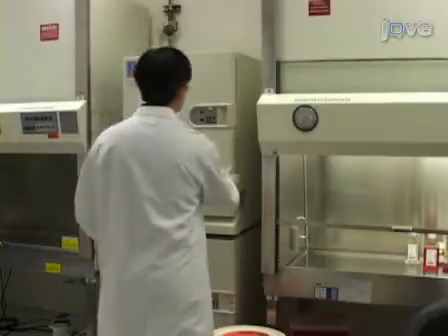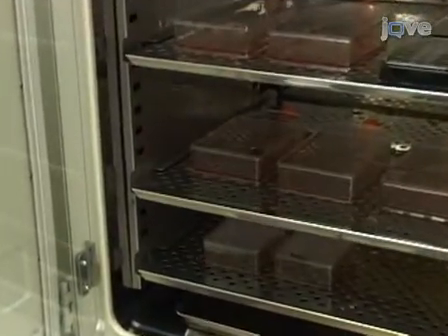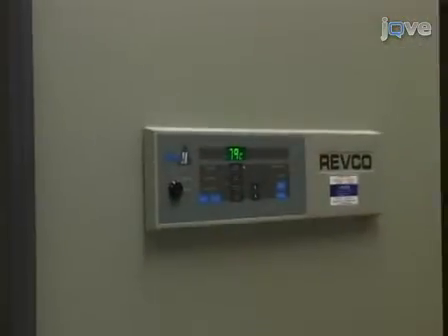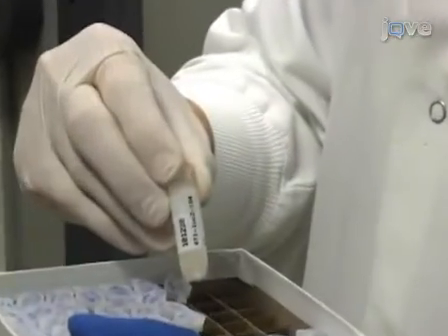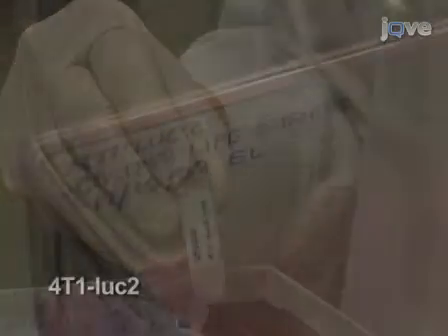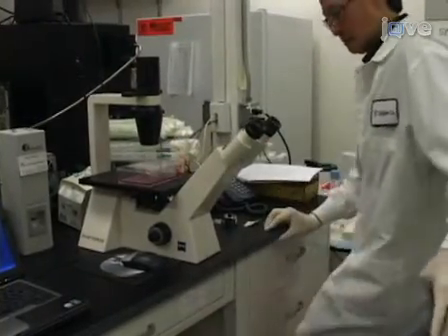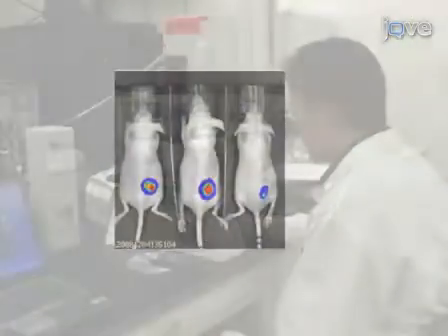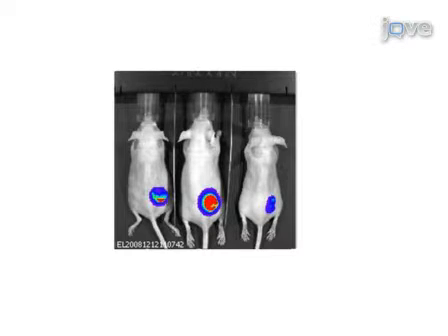This procedure begins by preparing the tumor cell line for injection into the mouse. A wide range of luciferase-expressing cancer cell lines can be used for bioluminescent preclinical experiments. These cells are provided as a pathogen-free frozen culture, which will readily grow in standard media with no need for selection markers. For our experiment, we'll use the 4T1 LUK2 murine mammary tumor cell line, which expresses the luciferase gene that serves as an optical indicator of gene expression or tumorigenesis in vivo. We will use luciferase expression to track growth of the primary tumor non-invasively, but it can also be used to locate and monitor metastatic lesions.